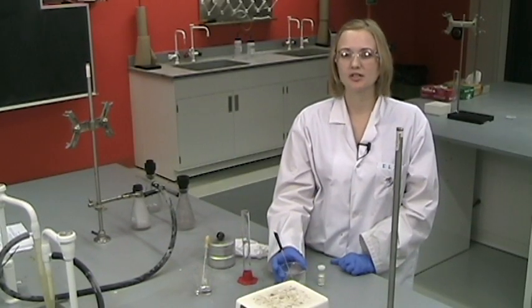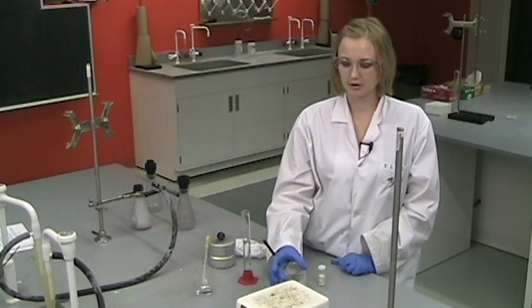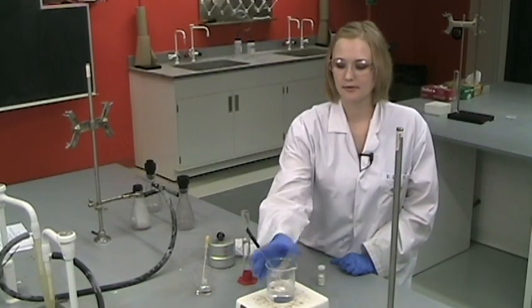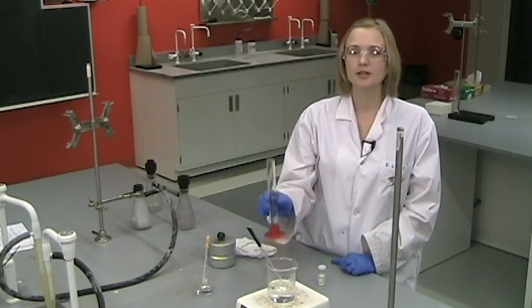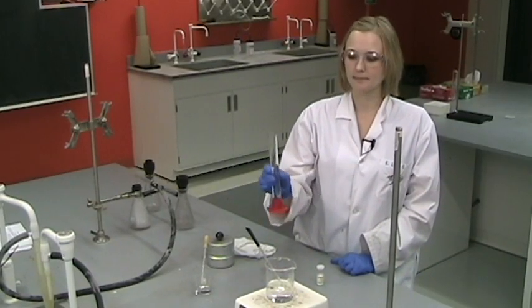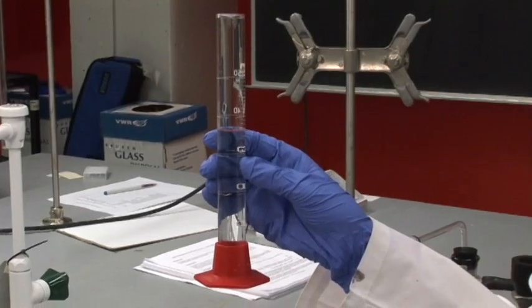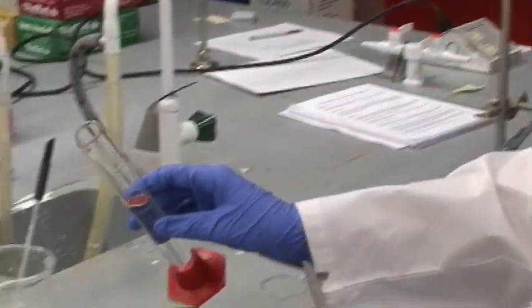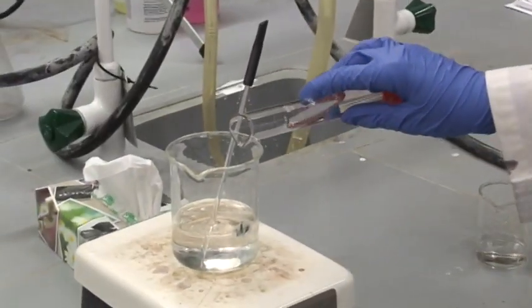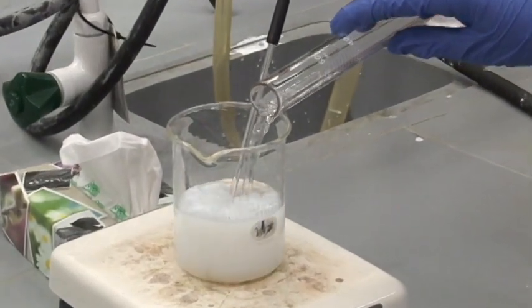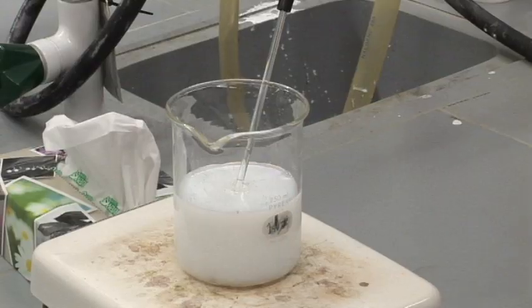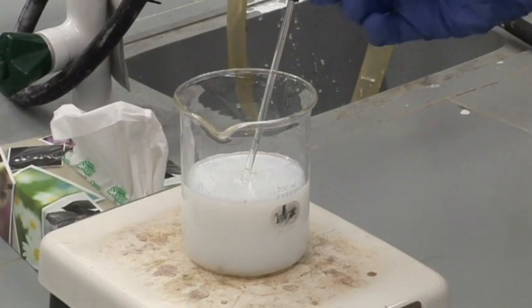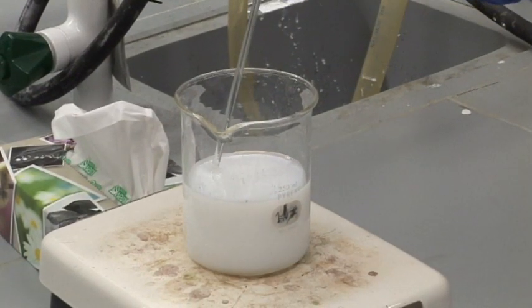Based on how much salt that you measured, you will be determining how much 0.1 molar silver nitrate you need to add to precipitate out all the chloride. So you'll measure that out using a graduated cylinder and then add it to your dissolved salt and you'll see this white precipitate form. This is your silver chloride, which is very minimally soluble in water.